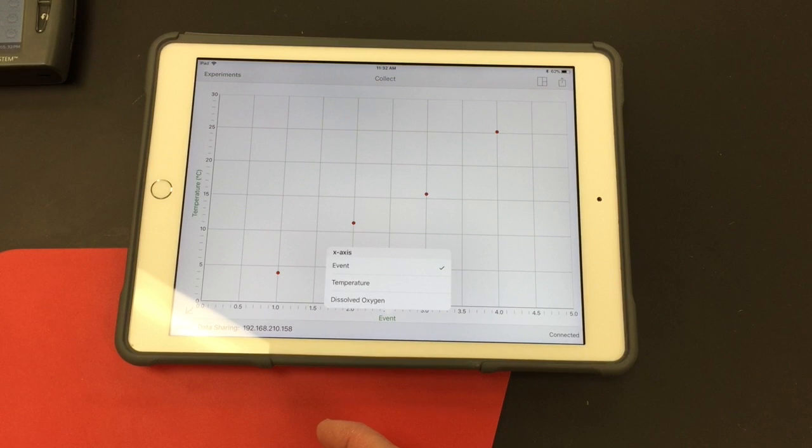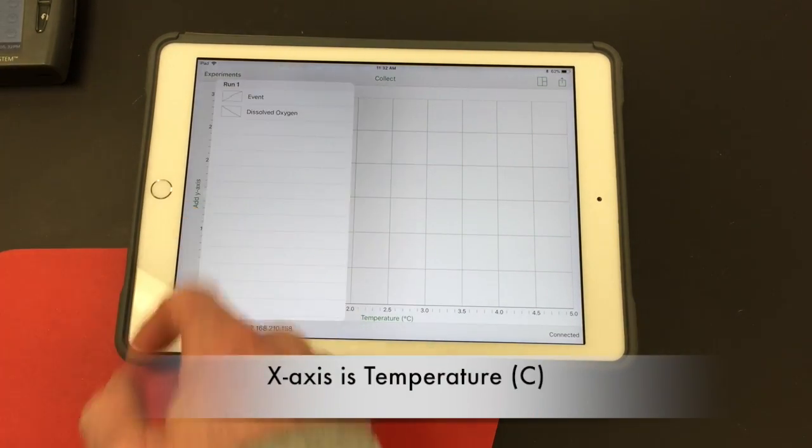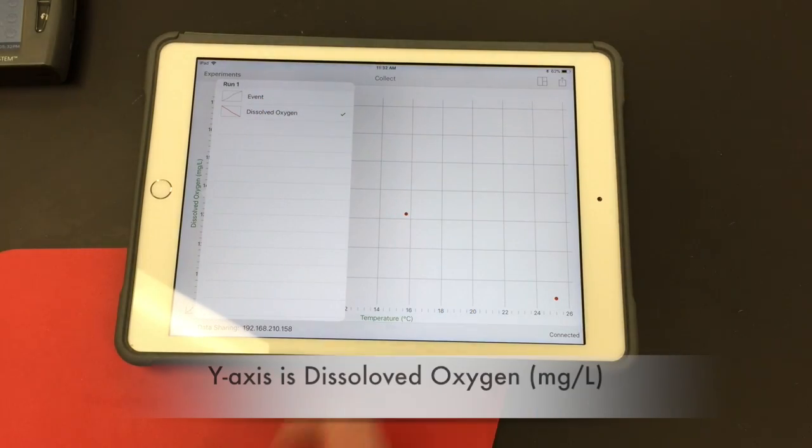So instead of event on the x-axis or the horizontal one, I'm going to change that to temperature. And on the y-axis I'm going to change that to dissolved oxygen.